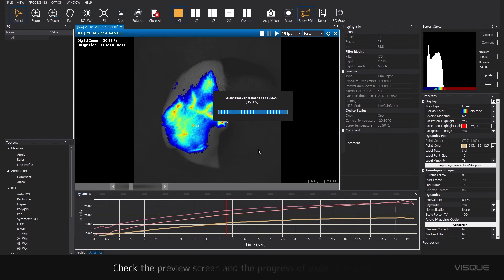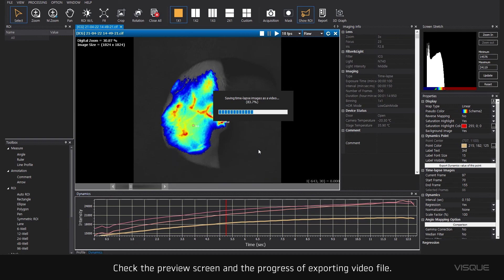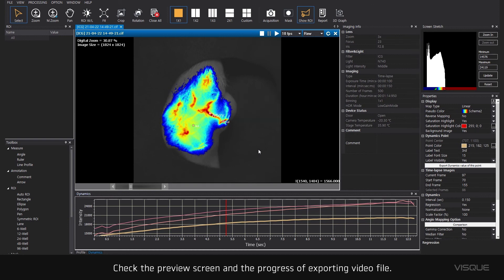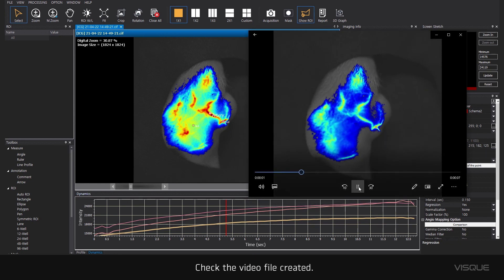Check the preview screen and the progress of exporting video file. Check the video file created.